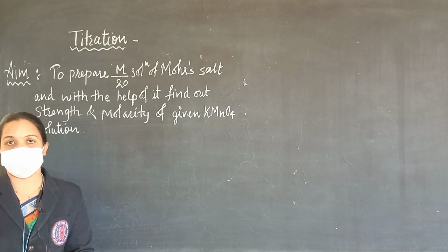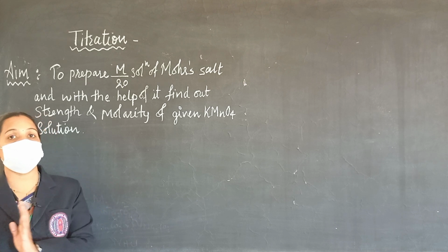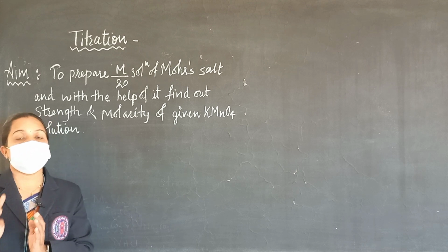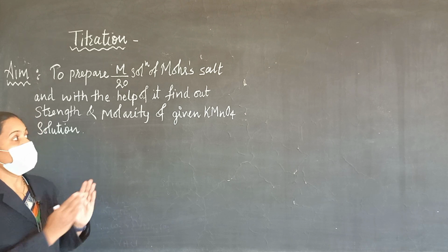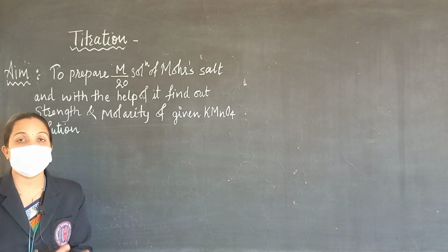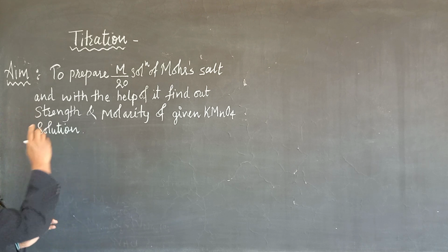In today's class we are going to see titration. How titration should be performed, what all things, calculation, observation and everything I am going to explain in today's class. So do watch this video completely. In this class I am going to explain how to prepare M by 20 solution of Mohr's salt, and with the help of this solution how to find out the strength and molarity of a given solution.